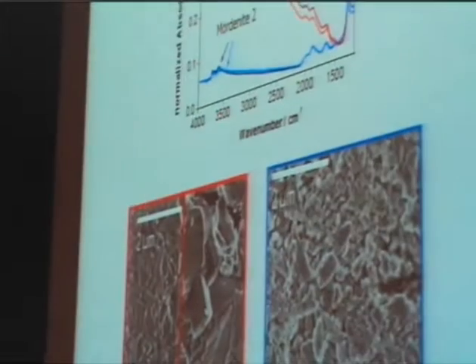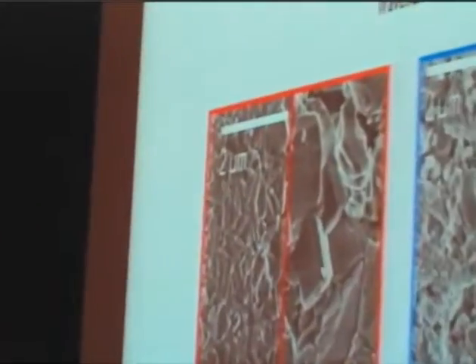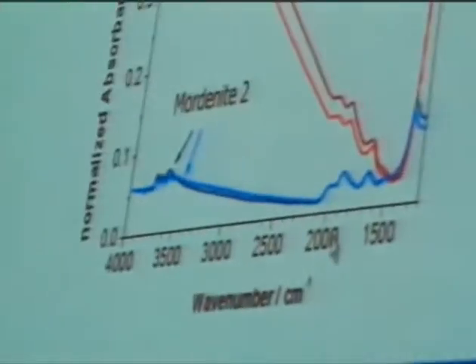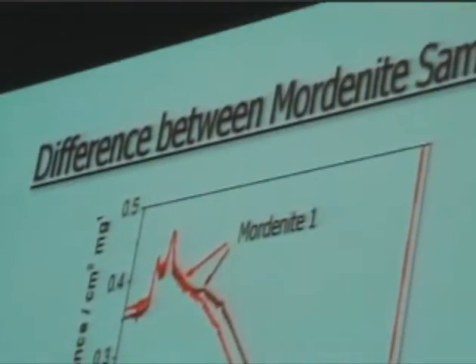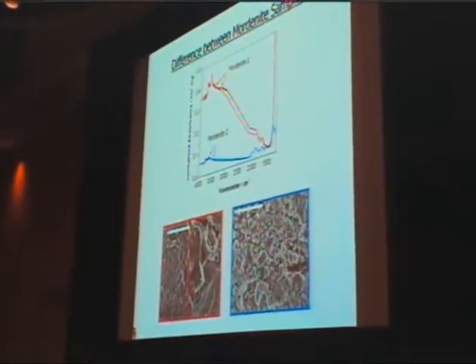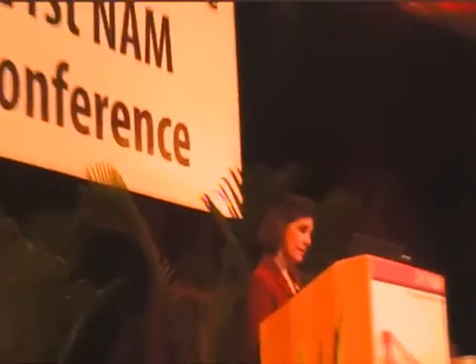And we noticed that when we looked at their infrared spectra, they produced quite a different background here. And the background from an insulator in transmission spectroscopy comes mainly from scattering effects. And that can be explained by the different morphology of these samples. You can see that this one sample here that produces this huge background features an inhomogeneous particle size with quite a wide range, and we believe that this is responsible for this background, while the second sample here is rather homogeneous in its morphology. Now, of course, we're correcting for this background and subtracting it, but that is not enough.